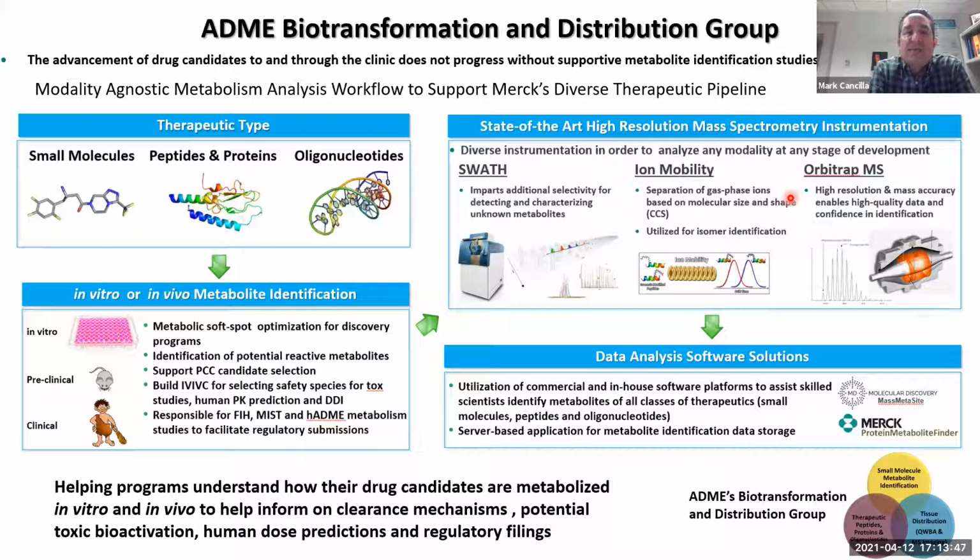So again, if you're going to have a modality agnostic pipeline, you have to have a lot of tools to cover what you need to analyze properly. And then finally, and this always seems to be the biggest barrier, is data analysis solutions. And we put a lot of effort into identifying the right software. And even in some cases, we've developed our own software.